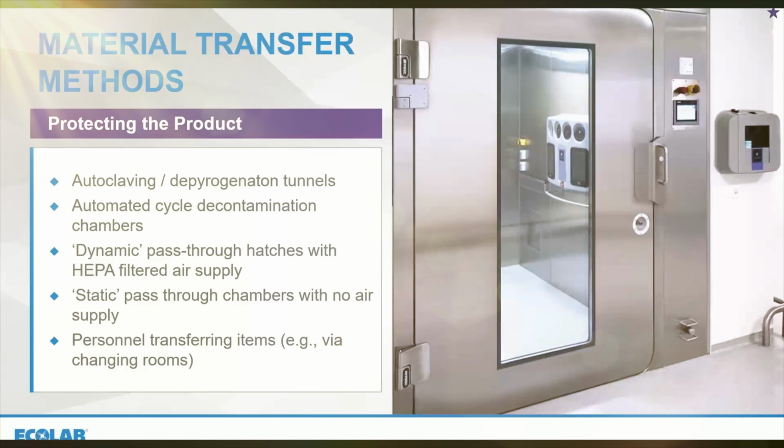This is a bad practice, and it wouldn't be one that we'd recommend and would probably get a regulatory citation. So we're really looking at hatches, automated chambers, or autoclaving, and the focus here is the hatch transfer disinfection process. So I'll hand you back to Helen.